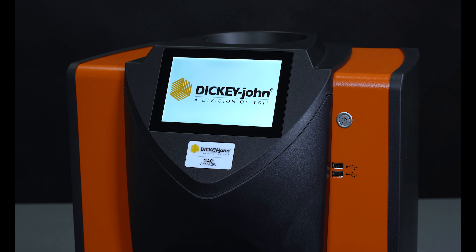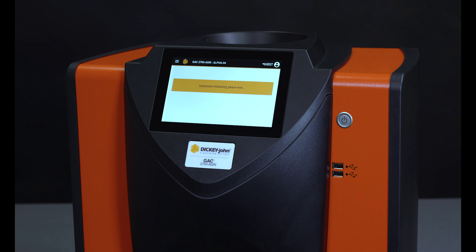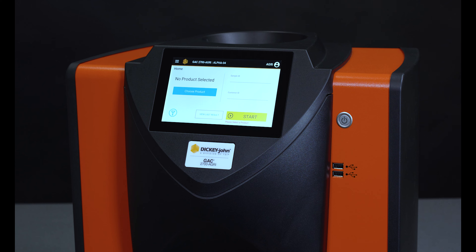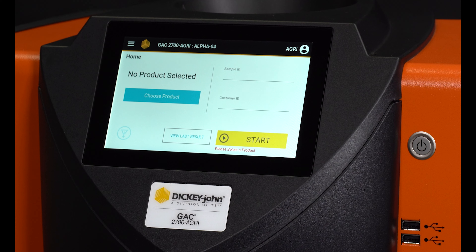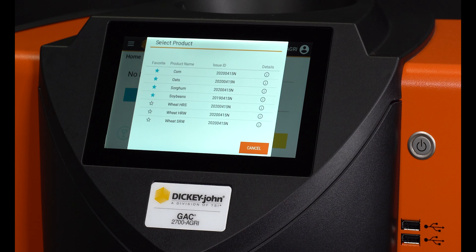The instrument will proceed to the home screen after power-up, which is an LCD touchscreen display. From the home screen, press the Choose Product button.